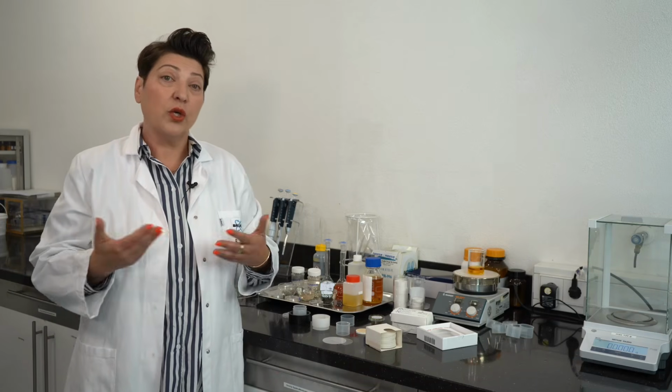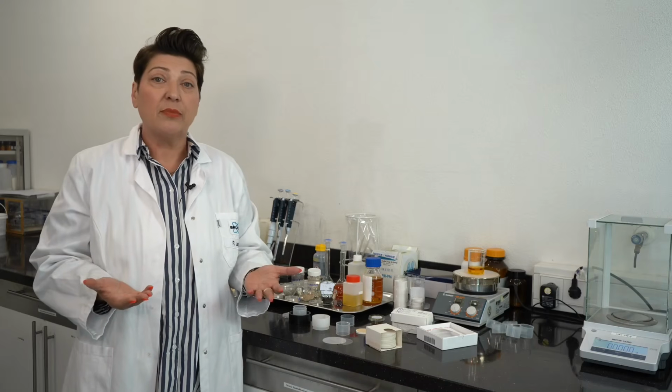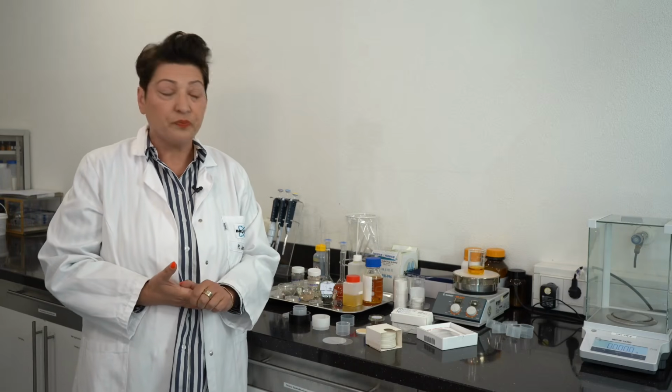Also, the measurement time has to be taken into account. When working with liquid samples in a liquid cup, the foil is also stressed while the measurement is running. So we have to take care that the measurement time is not too long. Typically, with a big floor-standing system of 4 kilowatt, I do not exceed 20-25 minutes of measurement time. This should be the maximum.